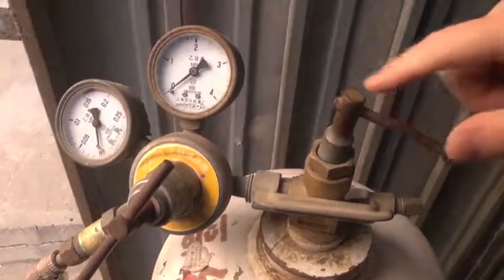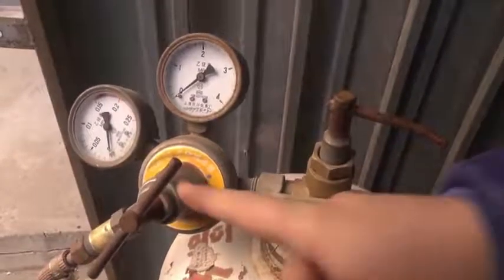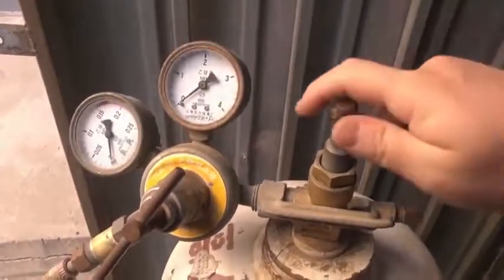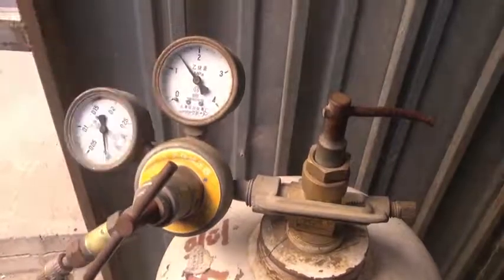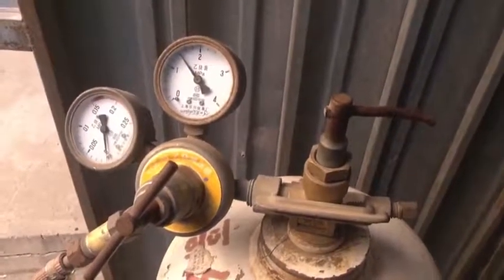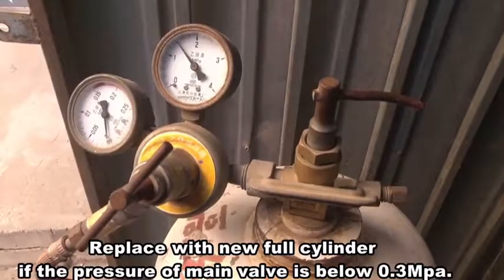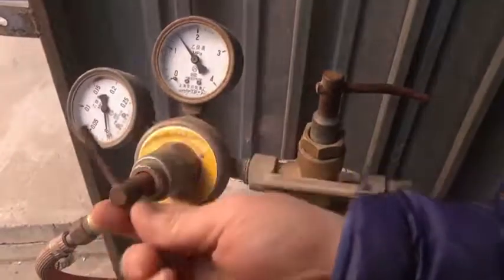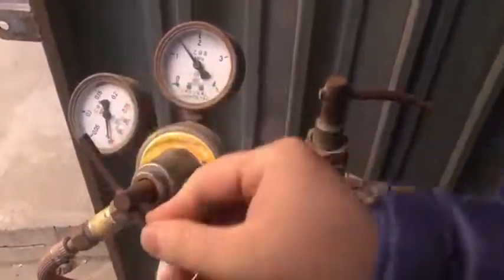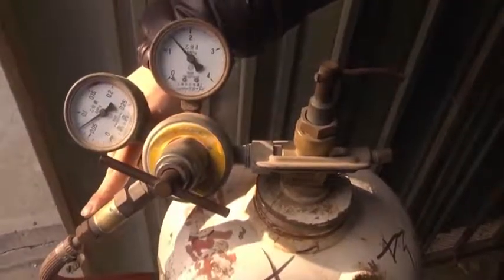This is the main valve for the acetylene cylinder. This valve adjusts the pressure of the outlet. When you open the cylinder valve, the main meter will show the pressure inside the cylinder. Once this pressure is less than 0.3 MPa, you need to change the cylinder. Rotate this valve to adjust the outlet pressure to 0.07 MPa. This hose connects with the A500.